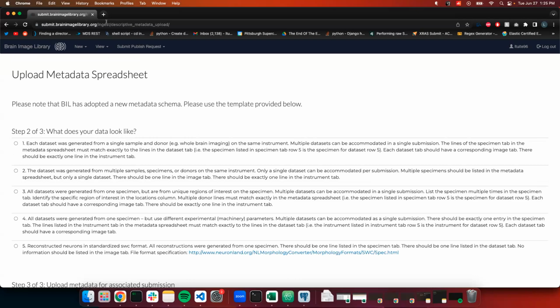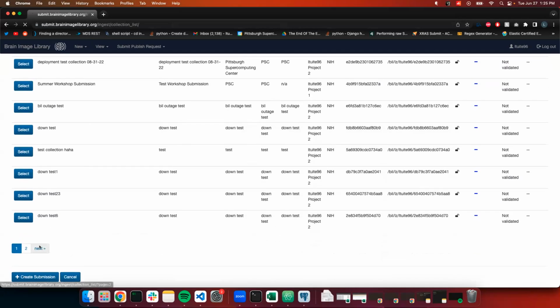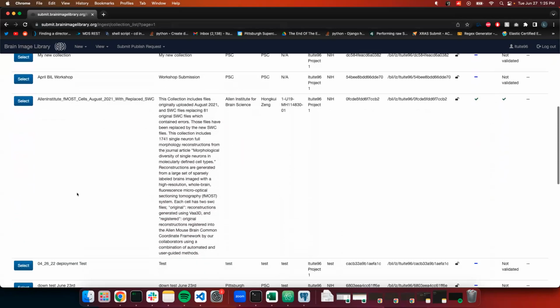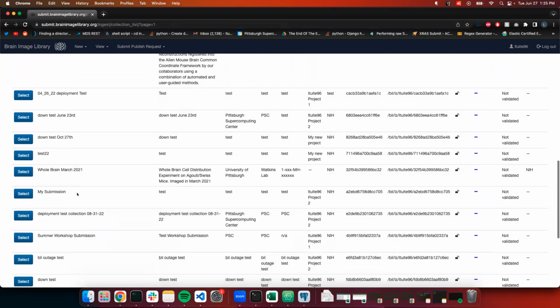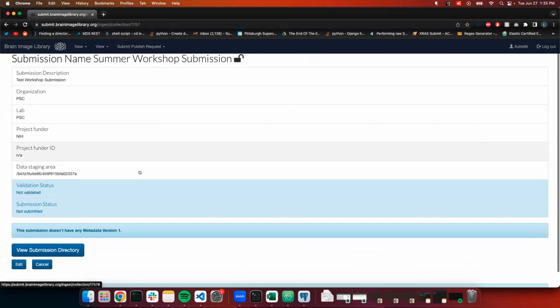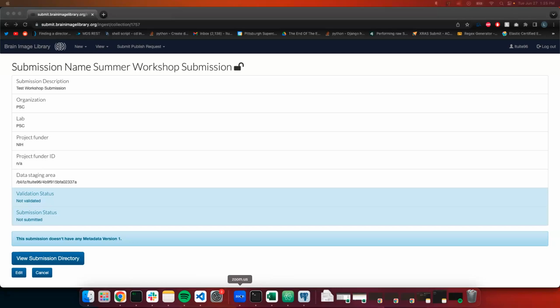Now we're not there yet. So if you go back up to view and then submissions, I have a lot here, but you folks should just see one, and that's the one we just created. Mine is called Summer Workshop Submission. I'm going to click on that just to get a better detailed view of this. And I'm going to flip back over now actually to my slideshow to explain a little more.